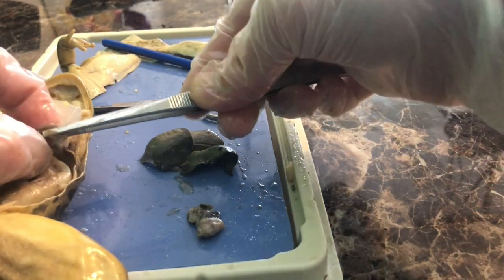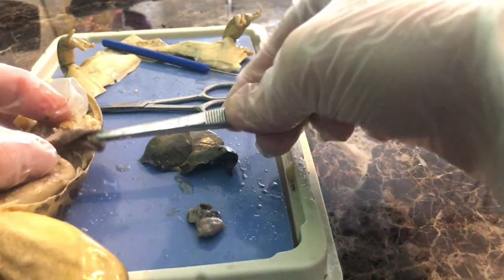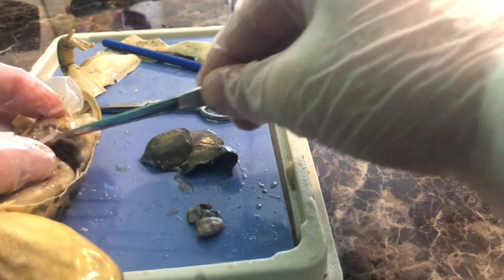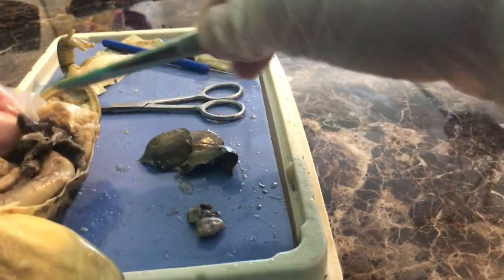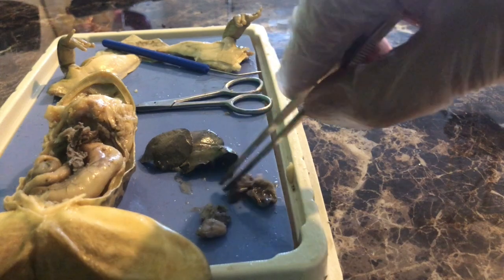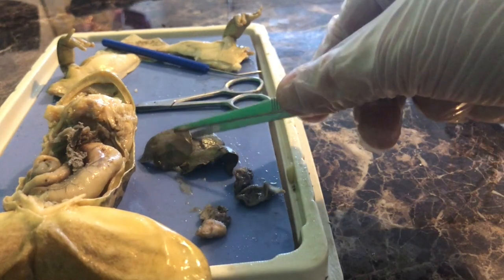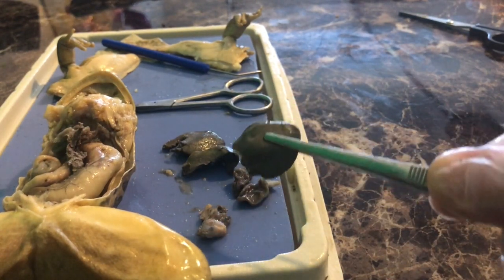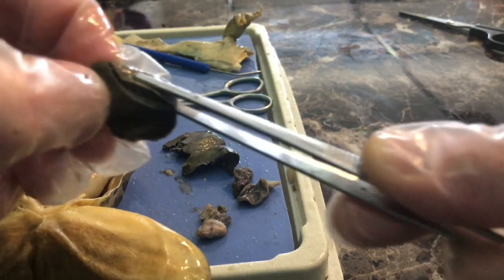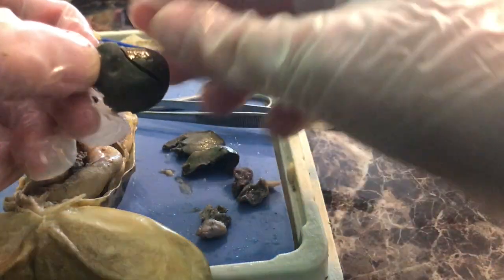The frog has a left and right atria — a-t-r-i-a — at the top, and a single ventricle — v-e-n-t-r-i-c-l-e — through which blood passes. Now let's take a look at where the lungs are. Because I removed the heart and liver, I can actually see the lungs. The lungs are very squishy and stretchy. They're located behind the heart and liver. Here's one — it looks like a little raisin — and here's the second. They're the respiratory organs.